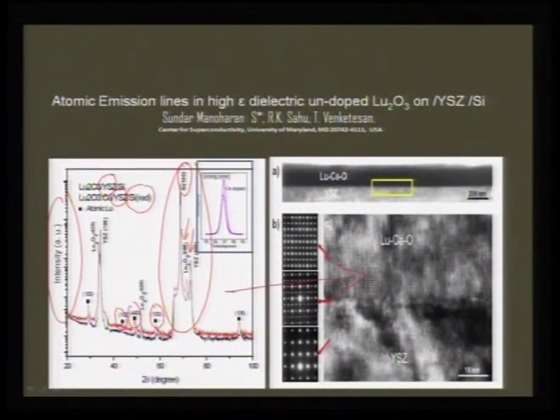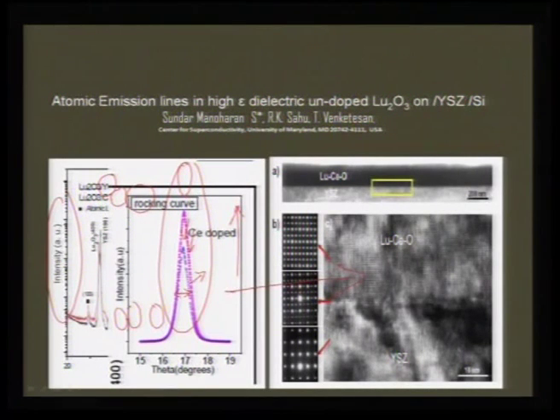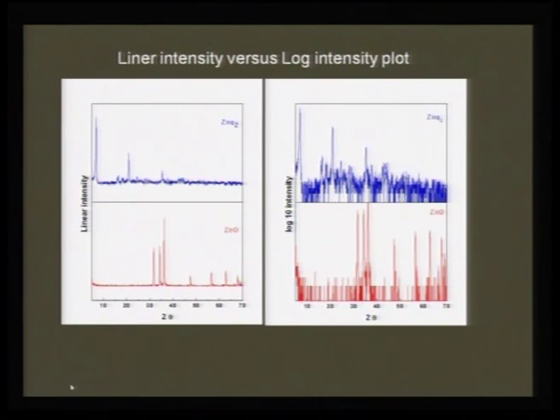Therefore, this is very important, and the other thing that will also tell whether it is a real epitaxy is nothing but your rocking curve. For each of these peaks, we can try to do a rocking curve mode, and the width of this rocking curve will tell how good the texture or growth of these films are. So, a rocking curve is one important accessory in thin films for you to map whether you are growing a textured film.